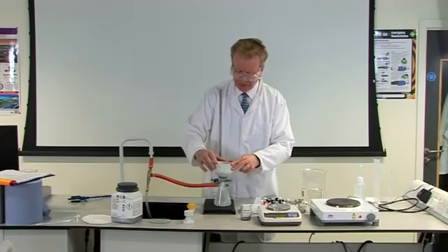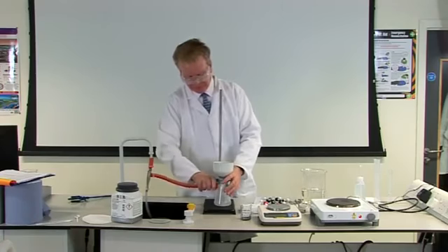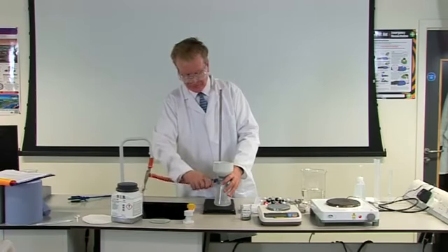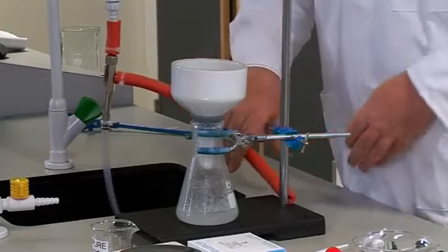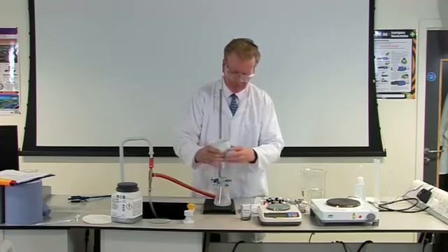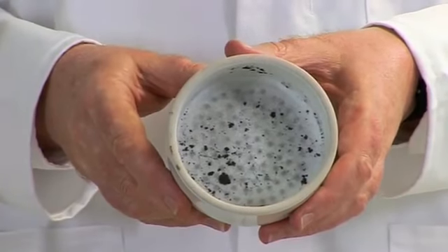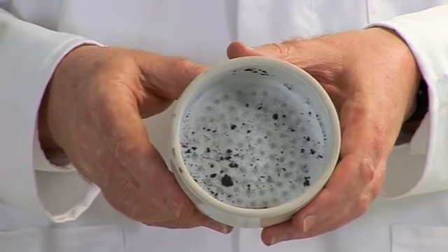Note the impurities that are left behind on the filter paper. Stop suction either by lifting the Buchner funnel and stopper out of the Buchner flask or by disconnecting the rubber tubing to the filter pump. If you turn off the tap, you may get a suckback of water into the Buchner flask. Take out the filter paper and discard it in the rubbish bin.